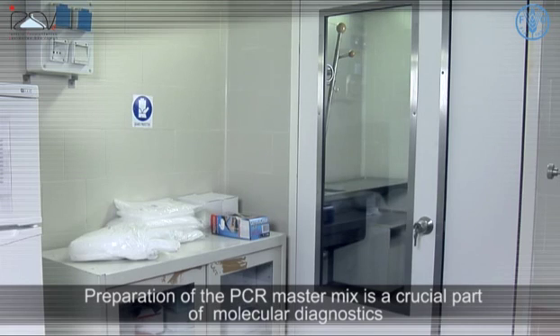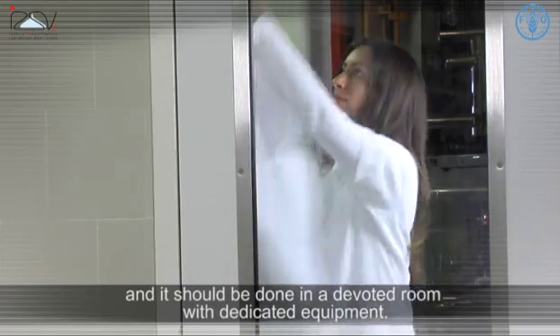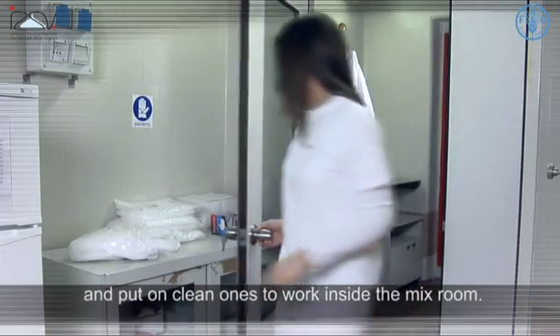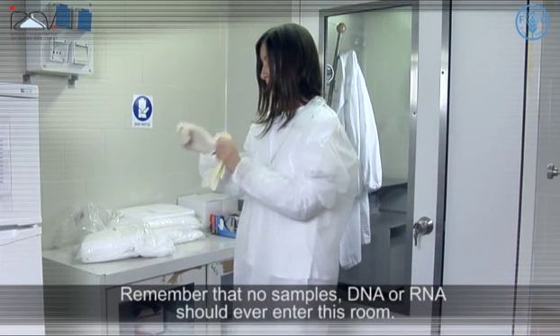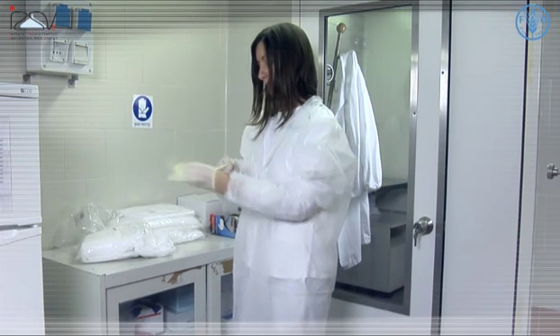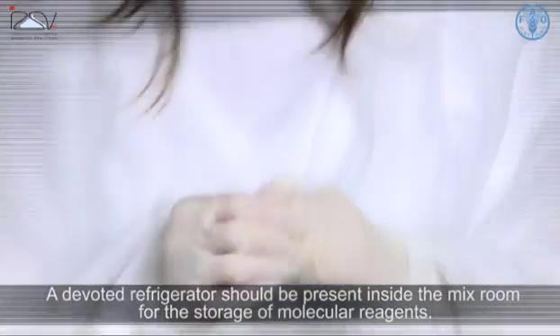Preparation of PCR master mix is a crucial part of molecular diagnostics and should be done in a devoted room with dedicated equipment. Leave lab coats outside and put on clean ones to work inside the mix room. Use clean disposable sleeves and gloves to avoid any risk of contamination. Remember that no samples of DNA or RNA should ever enter this room.